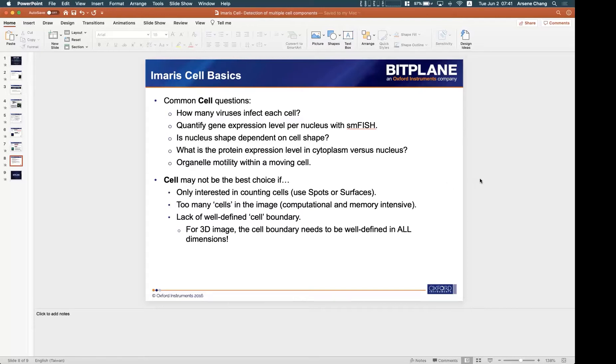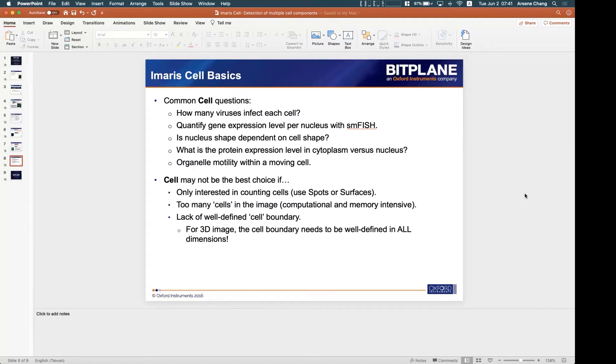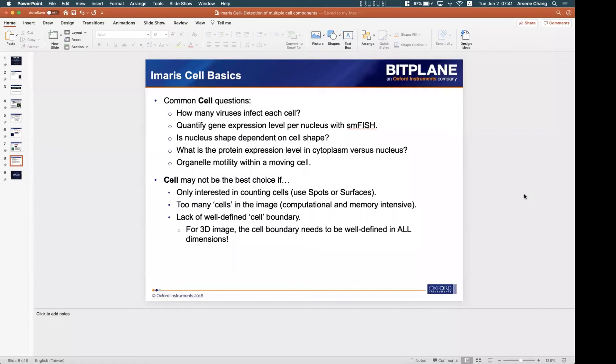Second, if there are too many cells in the image, because if you use cells you need higher computational and memory power. So if there are too many cells in the image, then probably it will take too much time or sometimes there will be errors in the images, so it will not be easy for those kind of images.